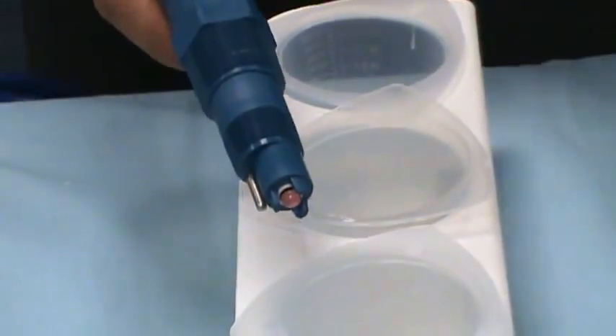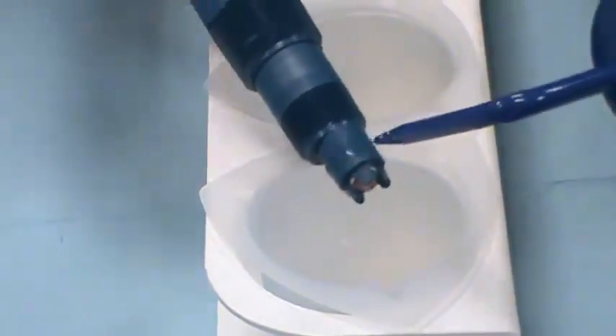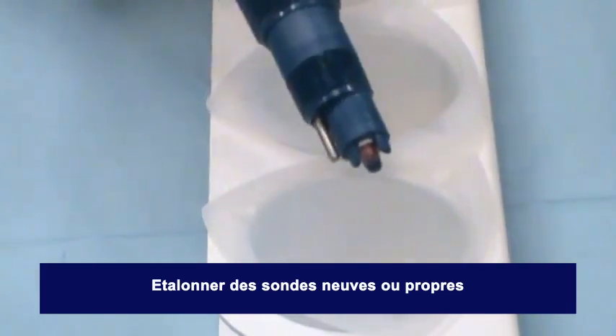Before you start to calibrate a pH sensor, make sure that the sensor is pulled out of the process pipe or tank. The sensor should be rinsed off from all process liquids.